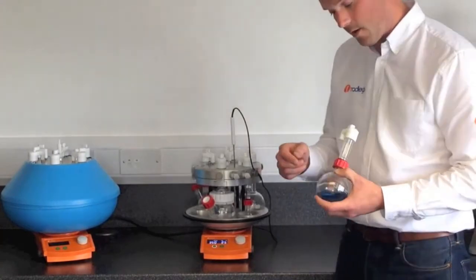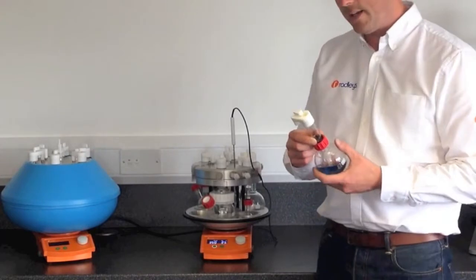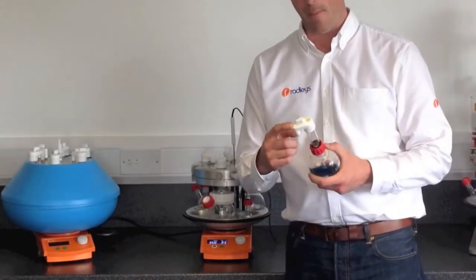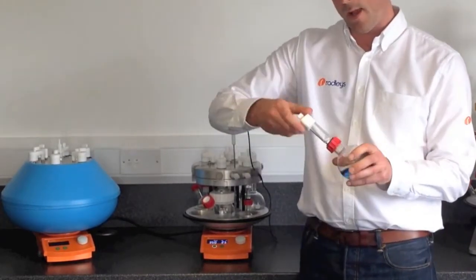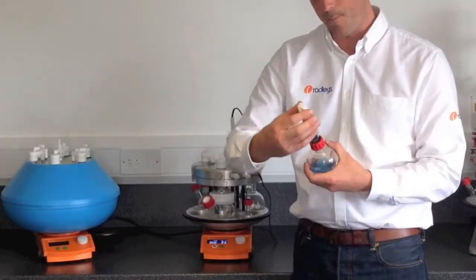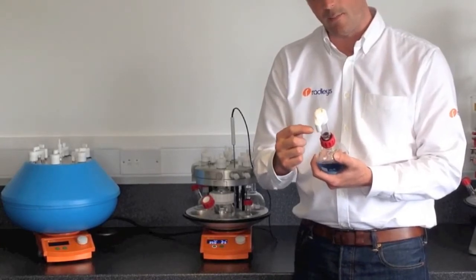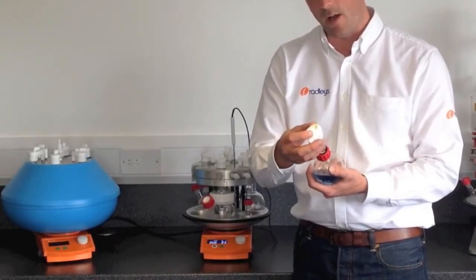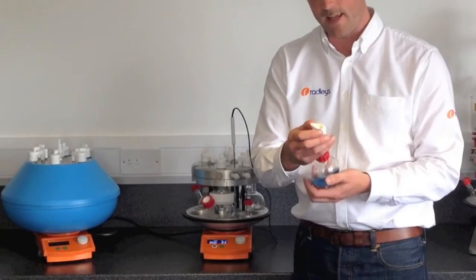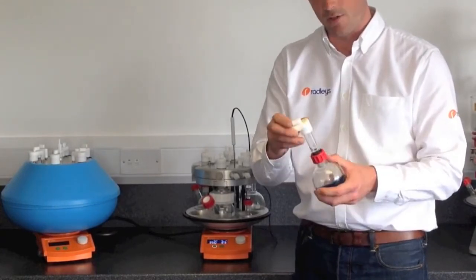We also have flasks for azeotropic reactions with a Dean Stark at the top. They all end in the EasyOn PTFE cap. The cap has a quarter-turn seal that offers a really good seal on top of the tube. It has a valve connecting the inert gas supply so that you can keep it under inert gas when you remove it from the reflux head, and a rubber septum so that you can take samples or make additions during a run.